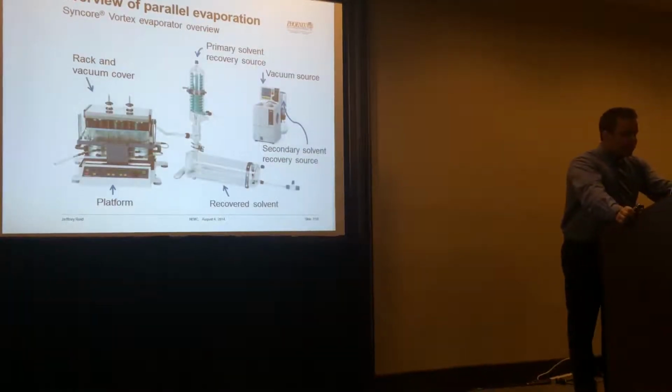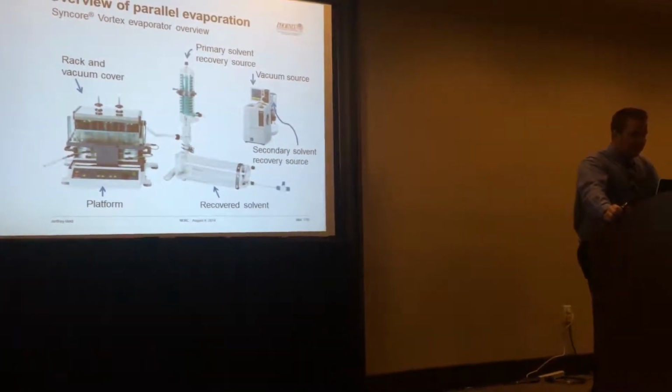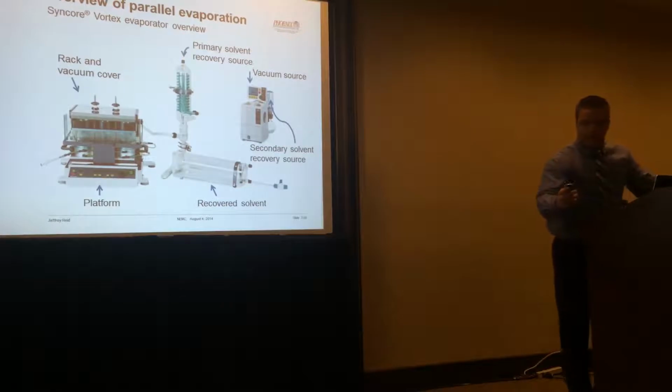So here's the overall schematic of the Vortex parallel evaporator. You have the actual platform shown here.